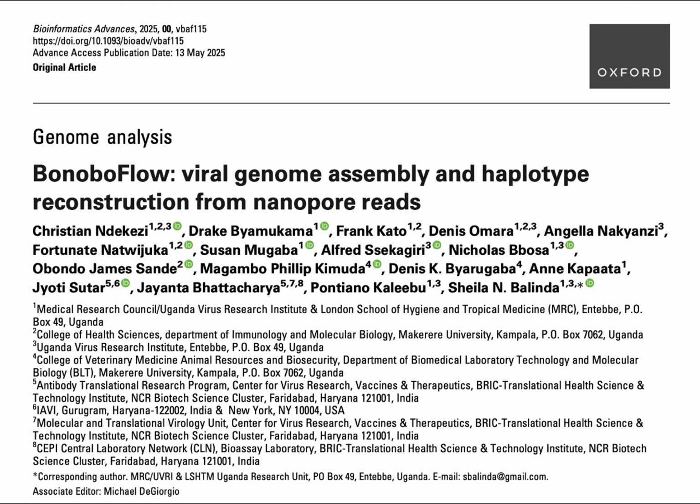Let's take PacBio first. It can achieve remarkable read accuracy. Really high, sometimes up to like 99.997%. Incredible precision. Wow. However, for widespread use, it comes with a pretty hefty price tag, both for the instruments themselves and the cost per sample. The workflows are complex, you need specialized infrastructure, and it demands substantial computational power and data storage. So super precise, but maybe not accessible for every lab or for large-scale surveillance. That's generally been the case, yes. It's powerful, but comes with significant logistical and cost barriers.